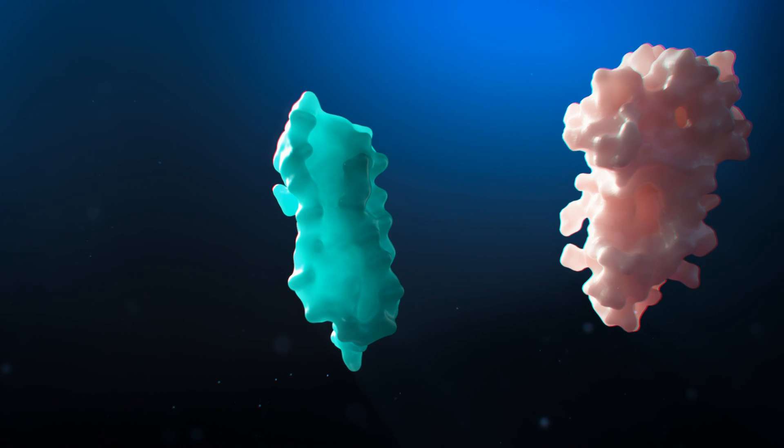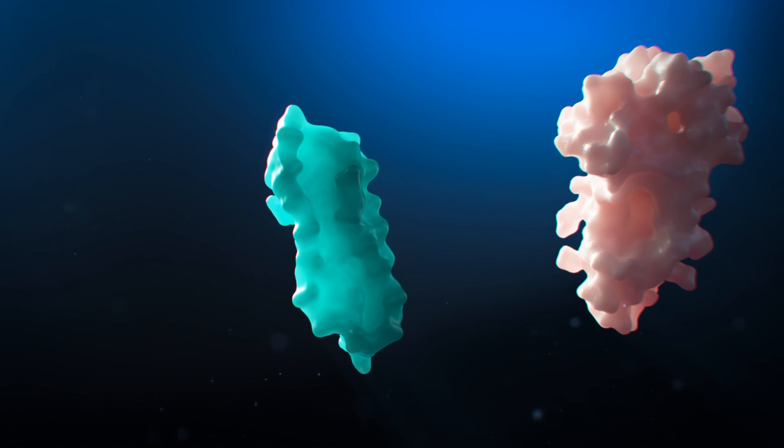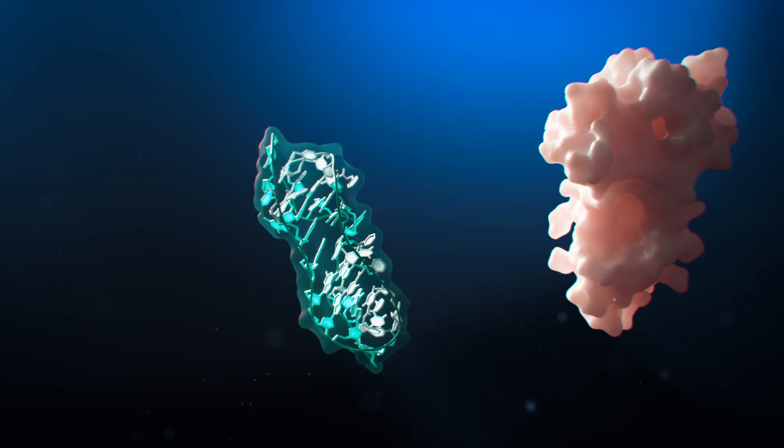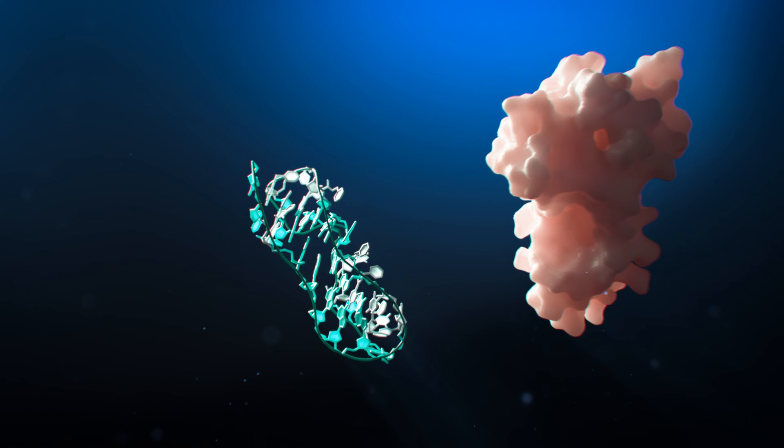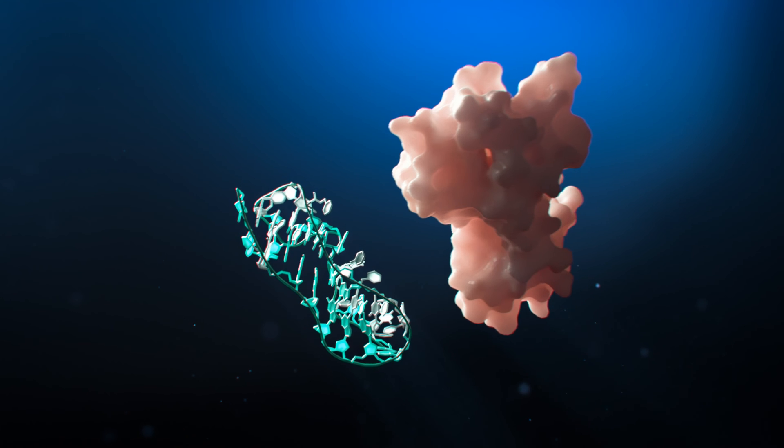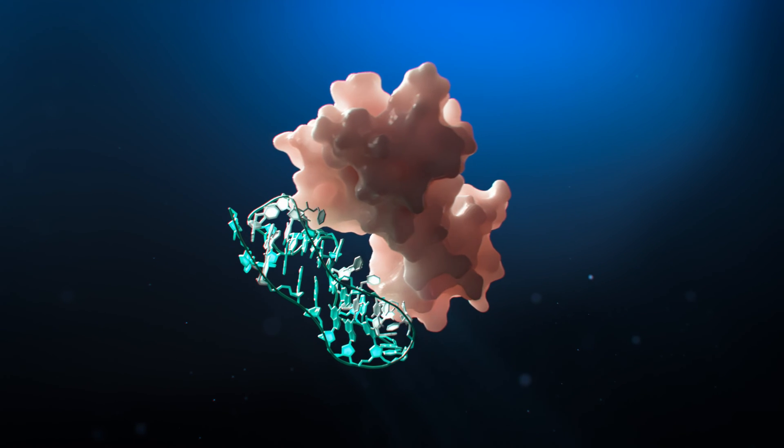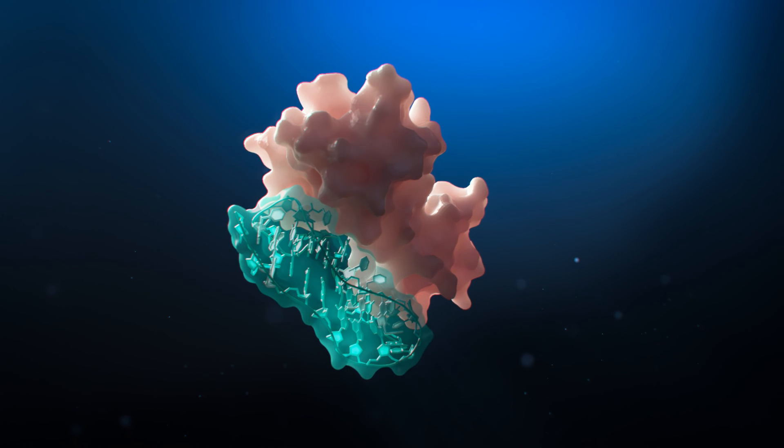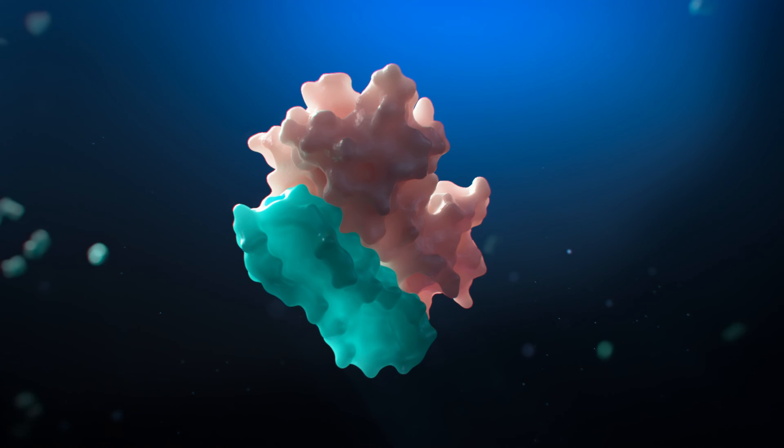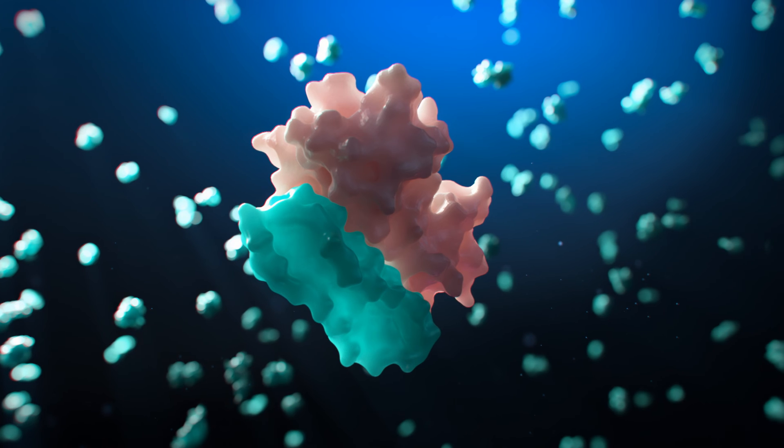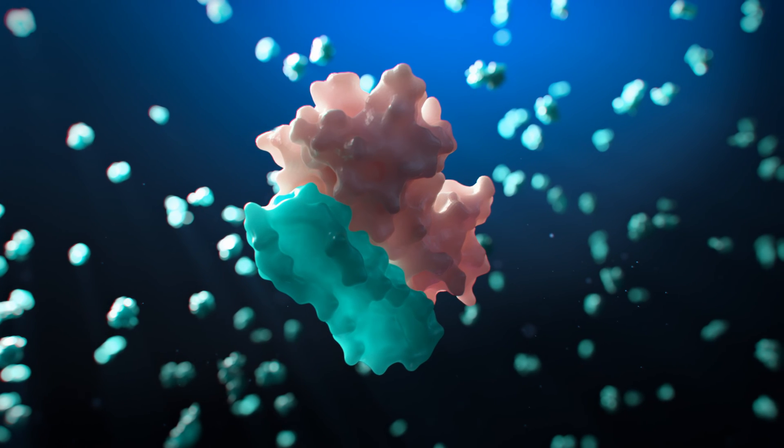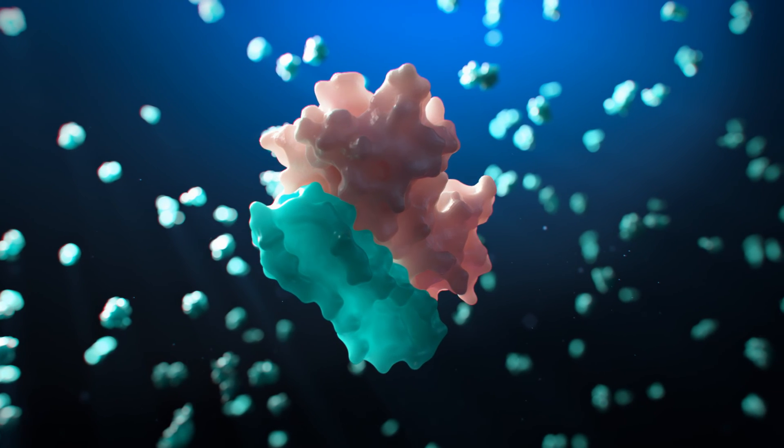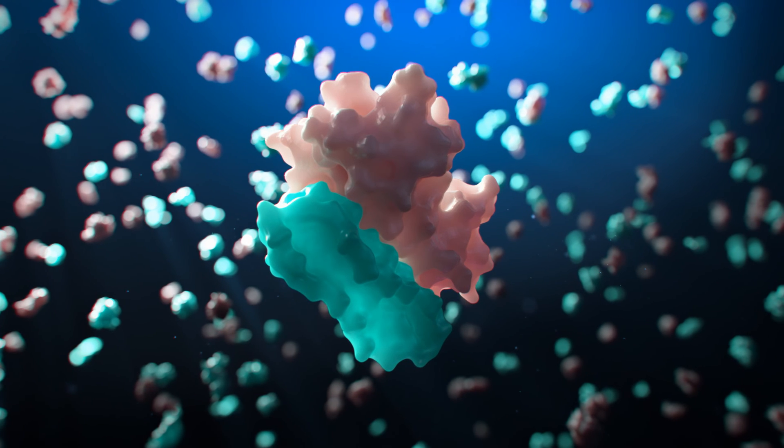Somomer reagents are custom-made to target each protein of interest. They have modified side chains that enhance shape complementarity with their target proteins and don't have the lot-to-lot variability inherent in antibodies. Each somomer reagent is selected from an enormous library of candidate sequences, a million billion molecules, until a perfect exquisite shape match is found for the protein target.